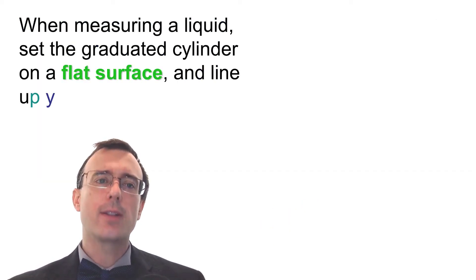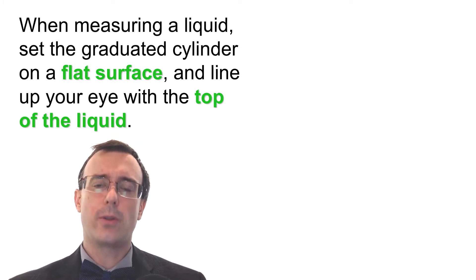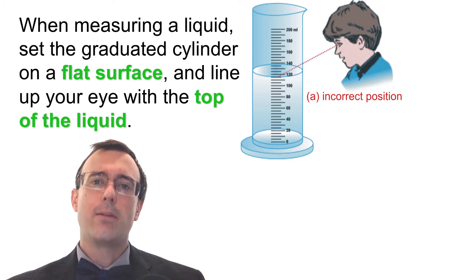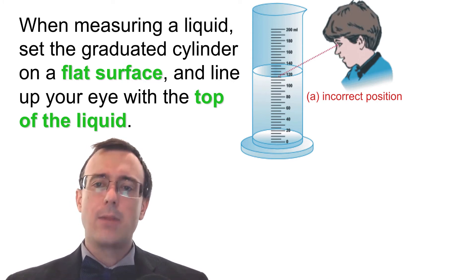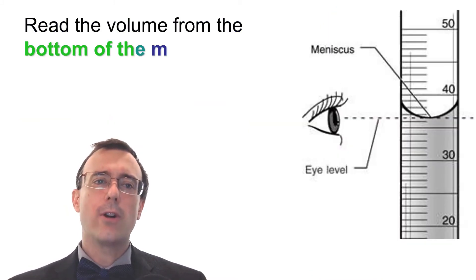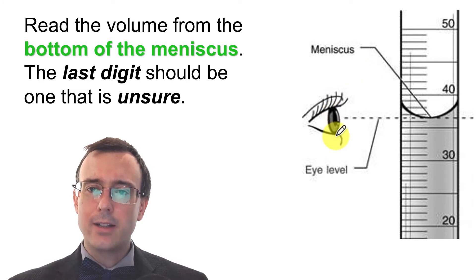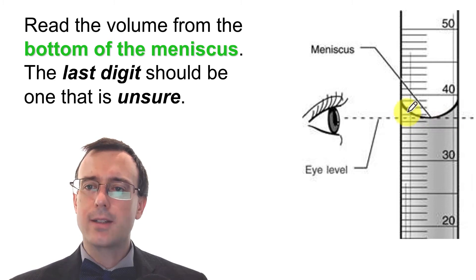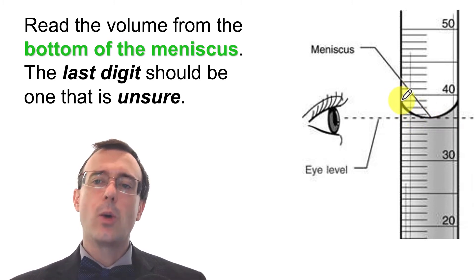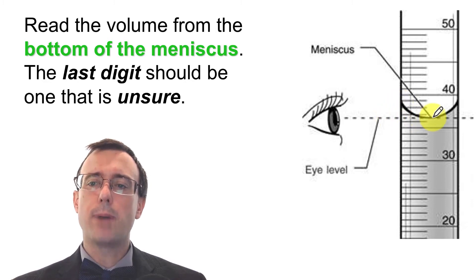When measuring a liquid, set the graduated cylinder on a flat surface and line your eye up with the top of the liquid. Never hold the graduated cylinder with your hand when measuring volume — you'll always get a poor measurement. Don't look down or up at the volume either. Read the volume from the bottom of the meniscus; the last digit should be the one that is uncertain. These measuring devices are always designed for you to read from the bottom of the meniscus for the most accurate measurement.